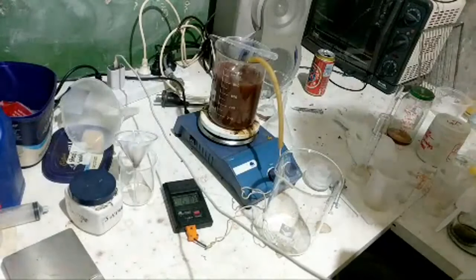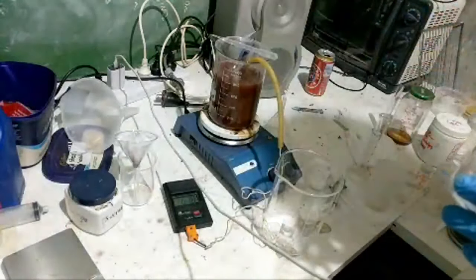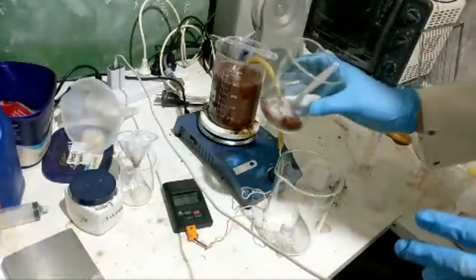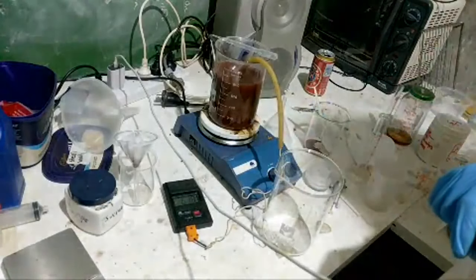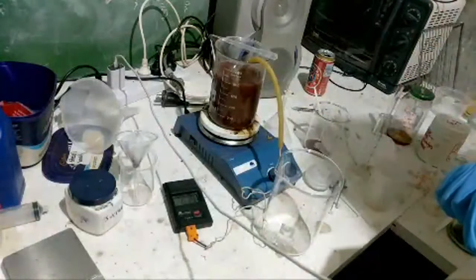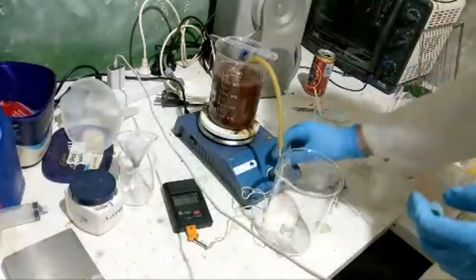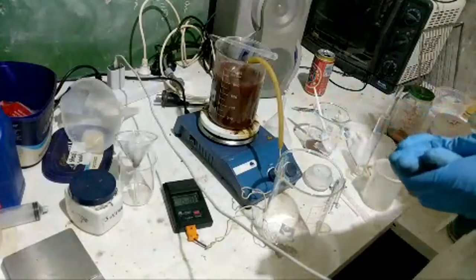Suppose what I could do is I could add some acid to this. I'll get a new container of bleach out, right? And dissolve this up in acid, and then add it to the bleach. You know what I mean? Or do we just quit? Why not just give up on this for the moment? I think so. We're 2 hours in. All right.